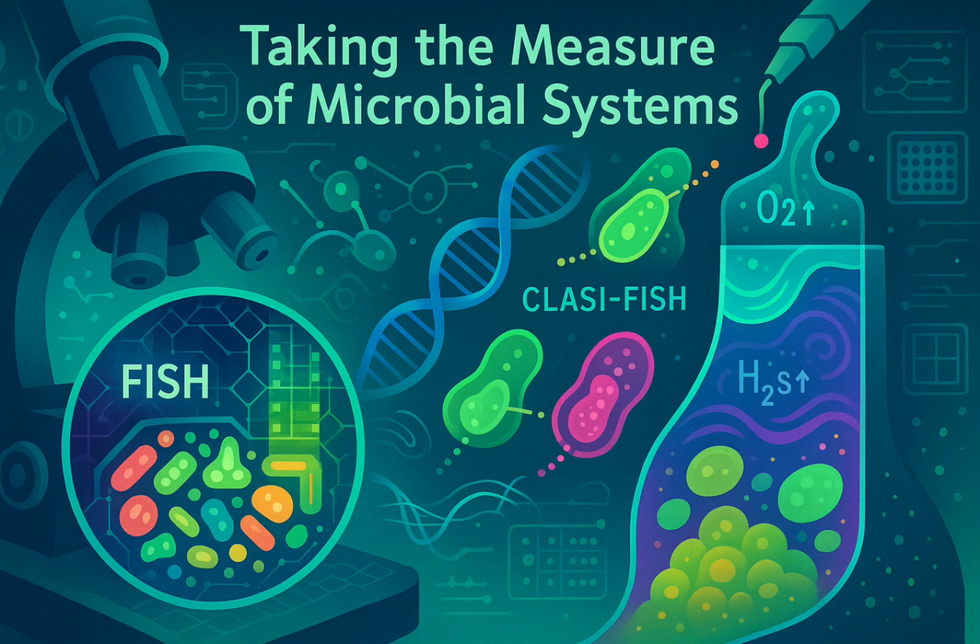But how do you make sure it's the microbes doing it and not just some random chemical reaction? Controls. Absolutely essential. The key one is the killed control. You run a parallel sample where you've killed the microbes, usually with a chemical like formalin or maybe by autoclaving it. If the reaction stops or drastically slows down in the killed sample, you know it was biological. Makes sense. You always need that baseline. Yep, and controls without the added labeled substrate too, to check for background noise.